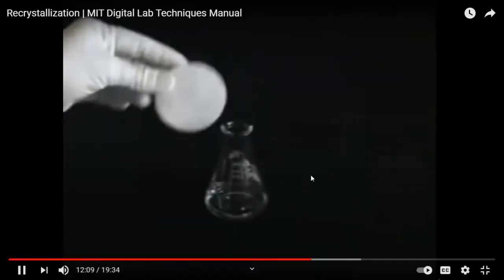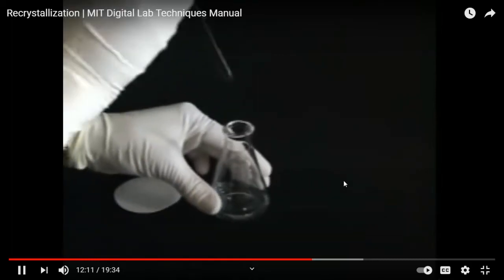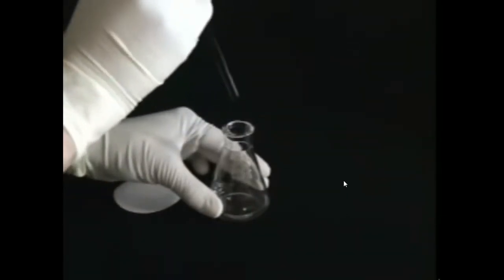If you forgot to set aside a seed crystal, you can also try dipping a glass rod in the solution, letting it dry so that minute crystals form on the surface, and then dipping it back in. The way they do here is you are making crystals out of the crystal solution. So it's like a second version of the crystal seed addition.